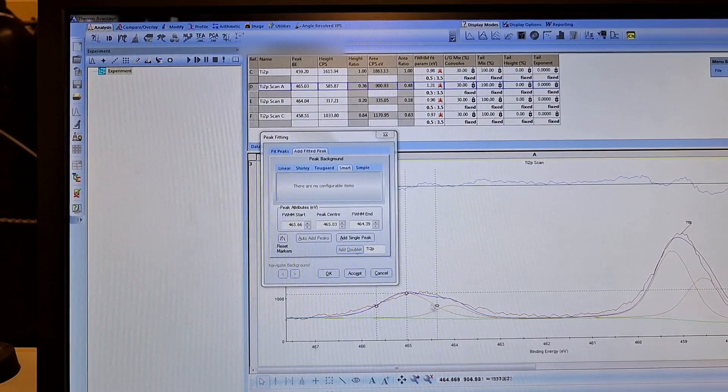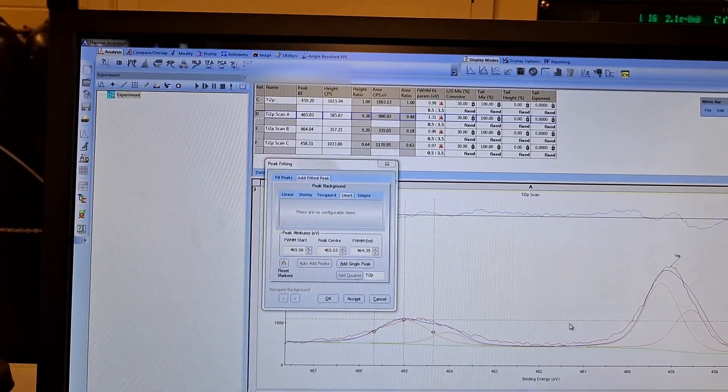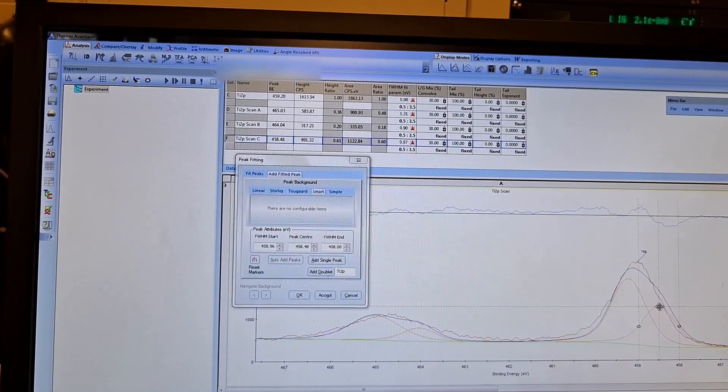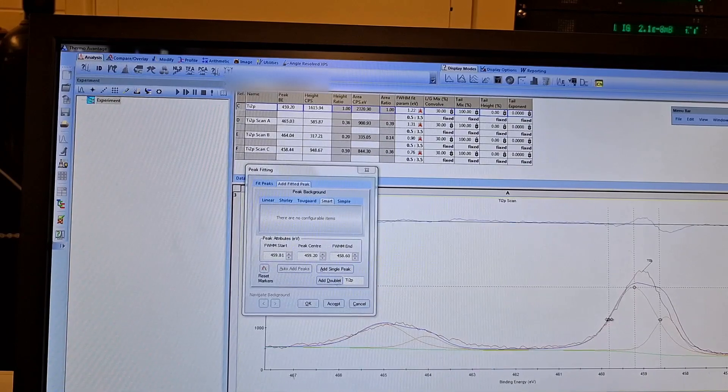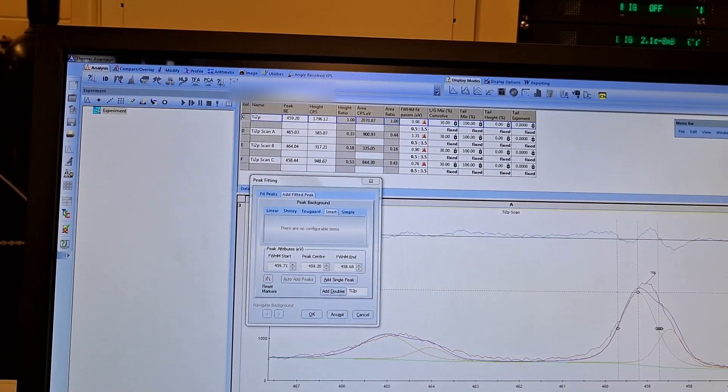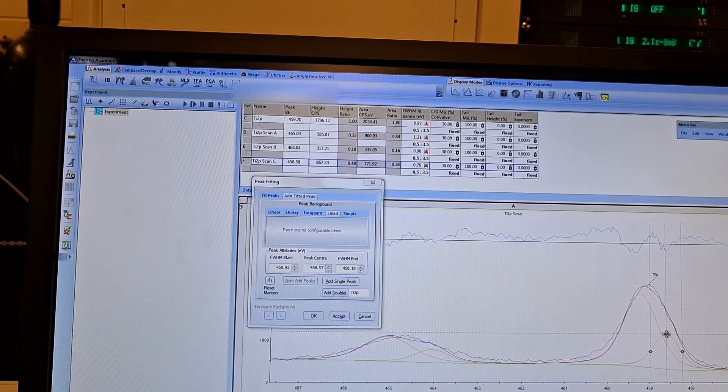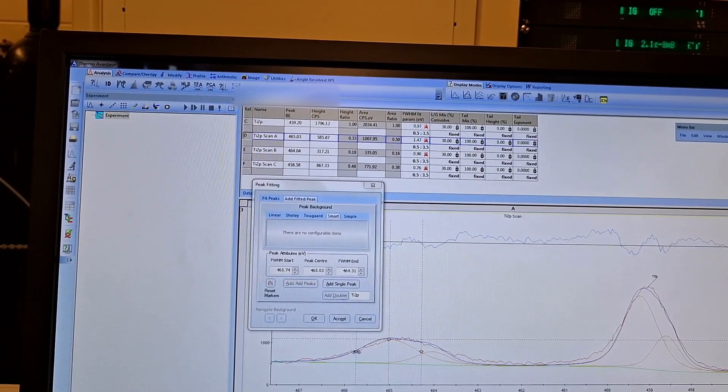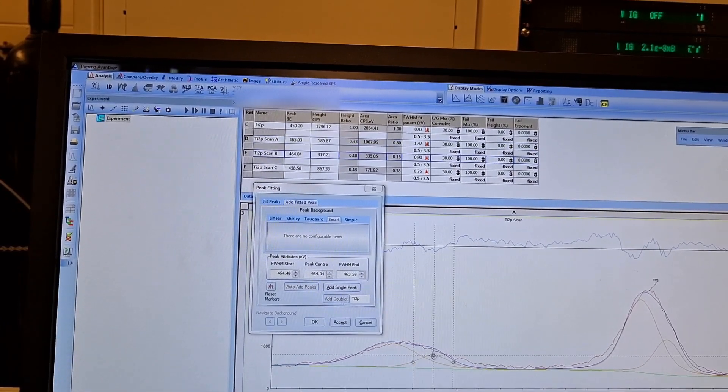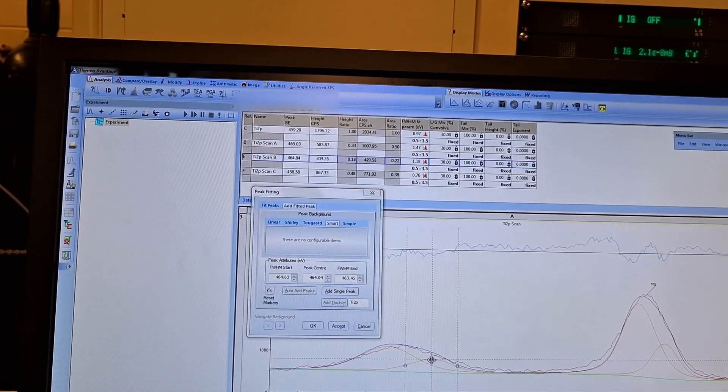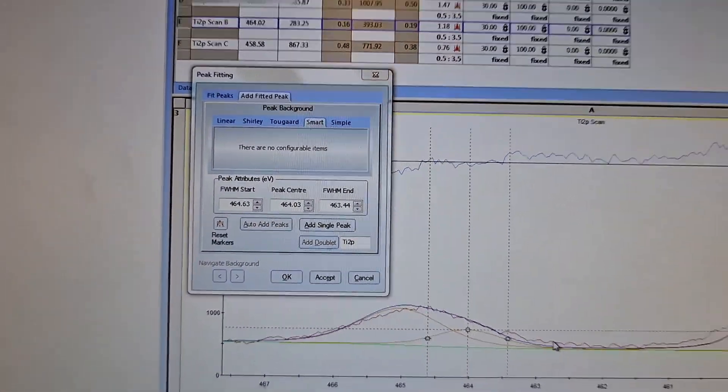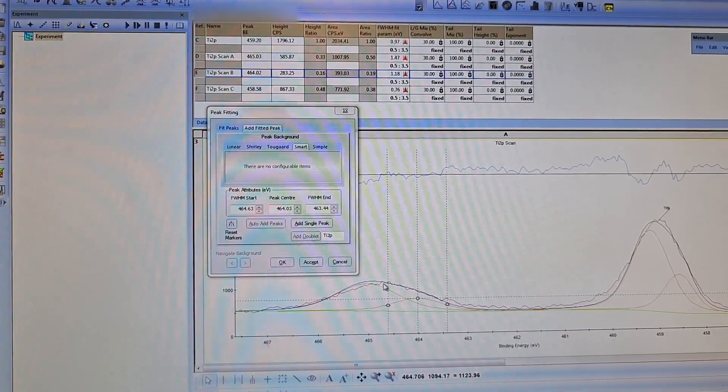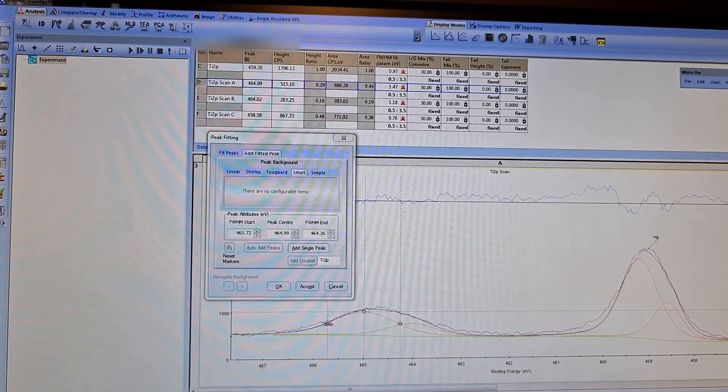We have both of them in here. The issue is that this peak area should be double of this peak area. Unfortunately, Thermo Avantage is not very useful here. Actually, I have to use Casa XPS, but I don't have Casa XPS right now. I have to adjust this envelope so the envelope should stick to the real signal.